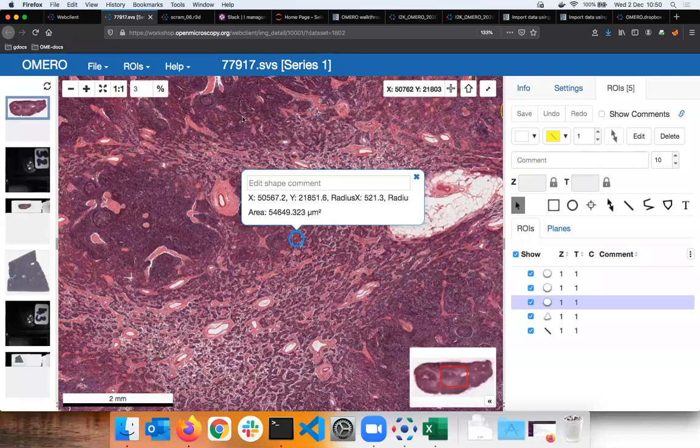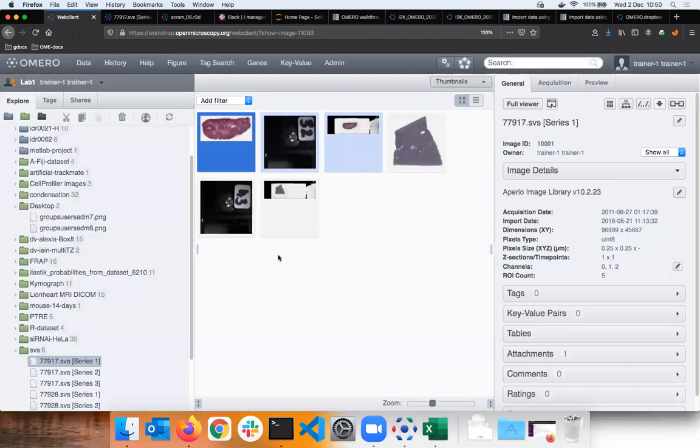For the OMERO iViewer, let's now draw our attention to the third-party tools, the analysis tools. First of all, I remind you what we have here. We have a server which is remote here in Dundee, and then we have a local application called Fiji. I hope that you all know Fiji, ladies and gentlemen, and we have a plugin for Fiji. This is like a software glue which uses the OMERO API, and it runs under Fiji.